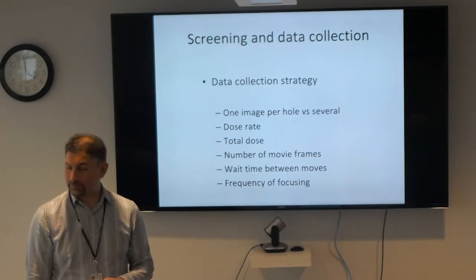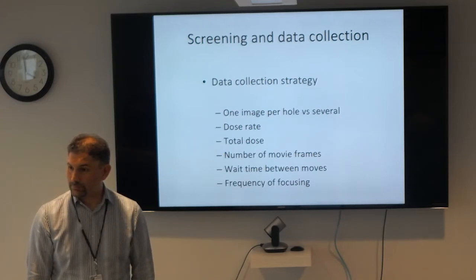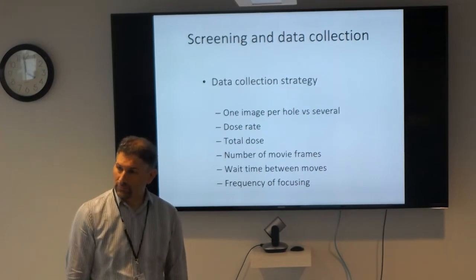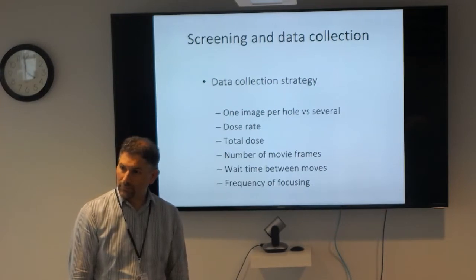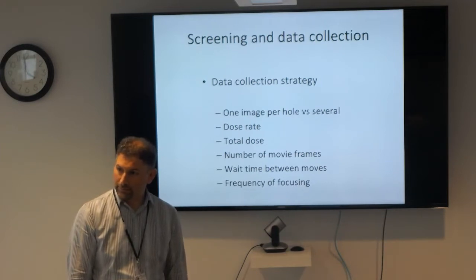Okay. From YouTube, this is from Kupju: Do you have to consider smaller beam size and also magnification when collecting several images per hole? And you might want to also comment on the parallel range. For a parallel range on a Krios, it's typically for 1 angstrom per pixel anywhere from 0.7 microns up to about 5 microns. So you want to be within that range to have a parallel beam.